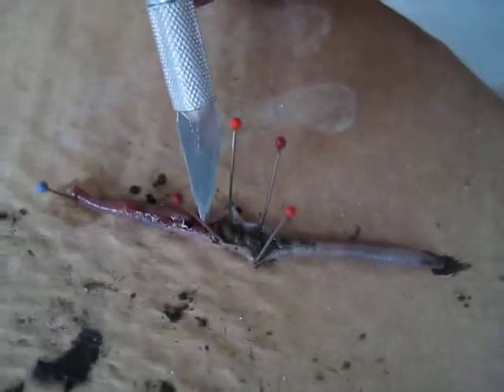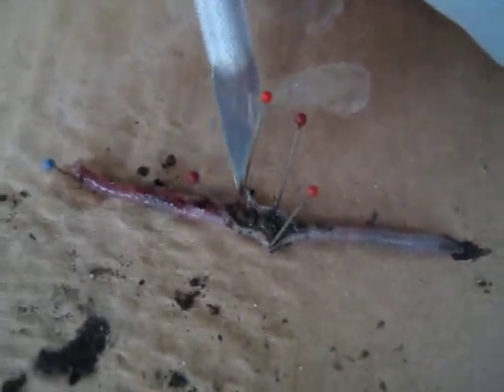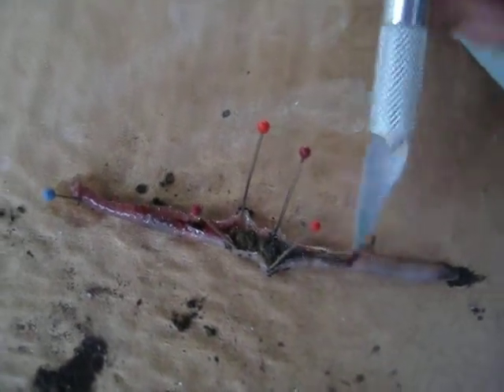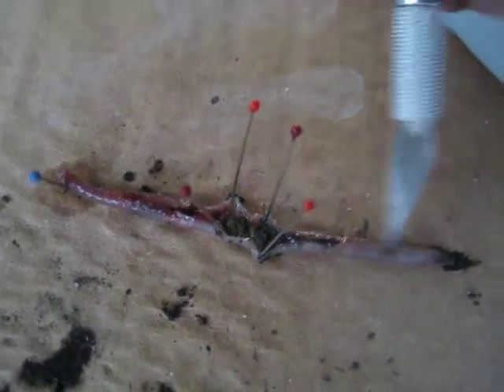You mean the aortic arches. Yeah. Because earthworms don't have hearts — they have five pairs of aortic arches, but you can't really see them because we kind of messed up. You see the intestine right there? Yeah, that weird poo-ish looking thing.